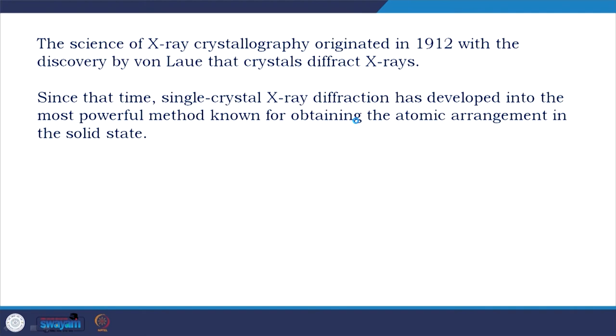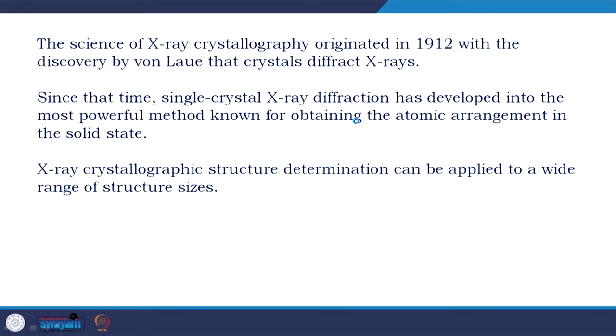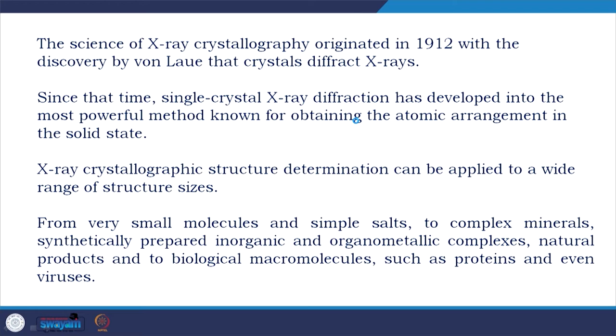Since that time, single crystal X-ray diffraction has developed into the most powerful method known for obtaining the atomic arrangement in the solid state. X-ray crystallographic structure determination can be applied to a wide range of structure sizes, which we have discussed and are going to discuss: from very small molecules and simple salts to complex minerals, synthetically prepared inorganic and organometallic complexes, natural products, and at the top, biological macromolecules such as proteins and now even big viruses. So, you could easily understand that von Laue and his discovery have changed the spectrum of research in X-ray diffraction and single crystal study. Let us try to understand the Laue equation.